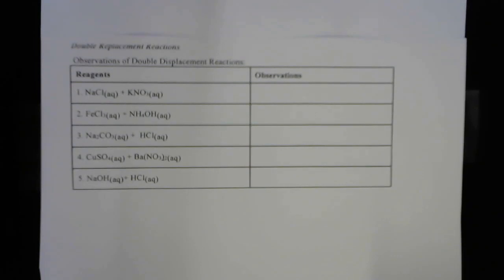So evidence for reactions that we're looking for are gas formation, precipitate formation, or heat being given off if there's a formation of covalent bonds. When a covalent bond is formed, the elements reacting to form the bond lose potential energy. They become more stable, and as they release that potential energy, it's generally liberated as heat. So again, we're looking for heat, bubbles, or precipitates.